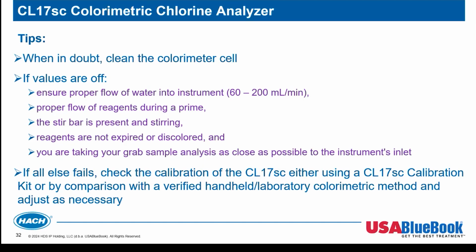And as always, this is a big issue that would pop up a lot back in my days on the road as well. If you're ever getting discrepancies between your handheld and your online analyzer, typically the problem was that we weren't taking our analysis or grab sample as close to the instrument's inlet as possible.